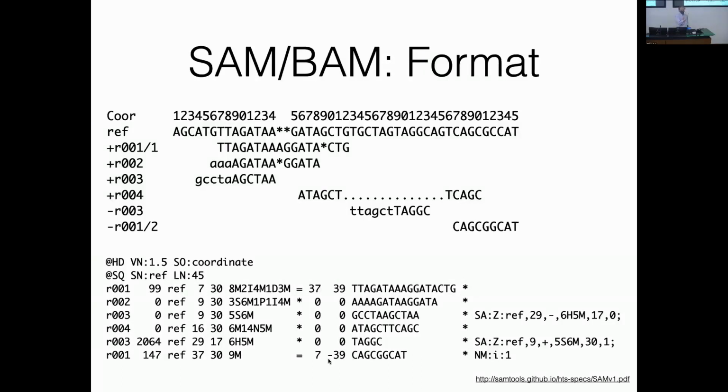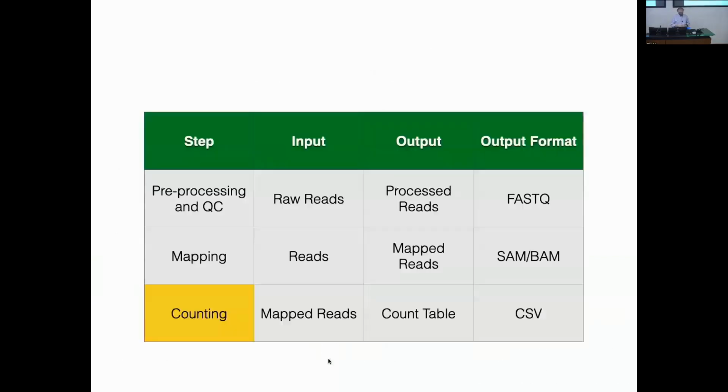Questions about this? You don't need to memorize it. I just want to give you a feel for what information's in the SAM or BAM file. I'll be testing you on other stuff, but not this. Okay. So counting is also kind of straightforward.